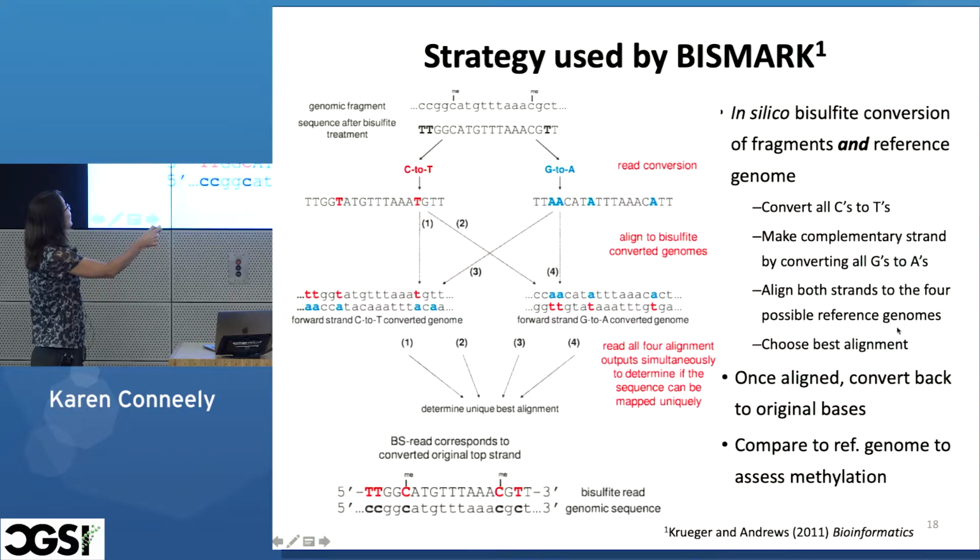And this diagram shows you how. Up here you have your original genomic fragment. You have 2 methylated C's on it. And then here it is after the bisulfite treatment. You find this thing in your library. And here it gets a little more complicated because you don't know if this was the original DNA that got bisulfite treated or if this is a complement of it, like if this happened after PCR amplification.